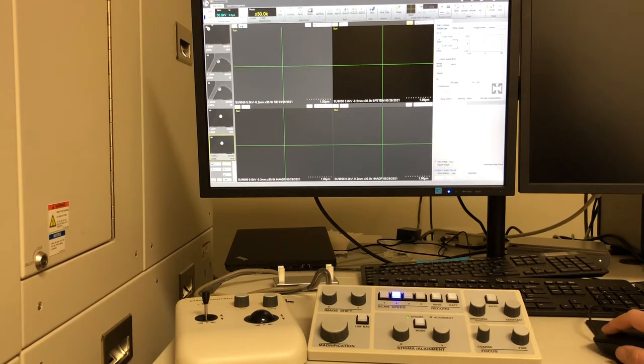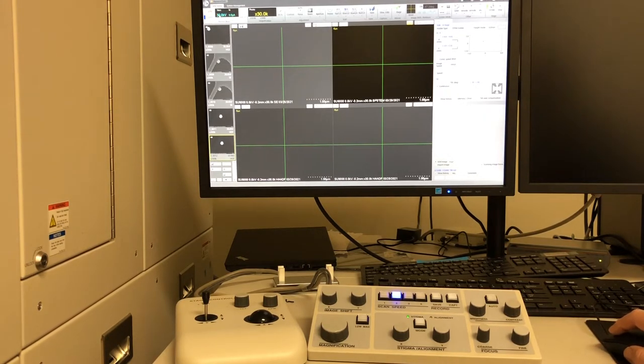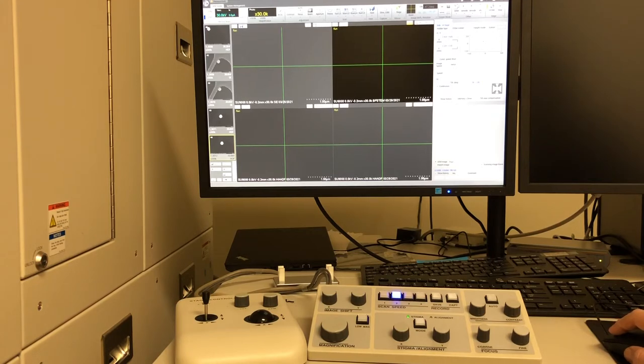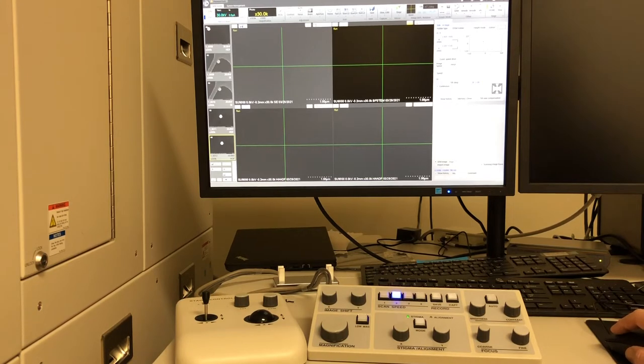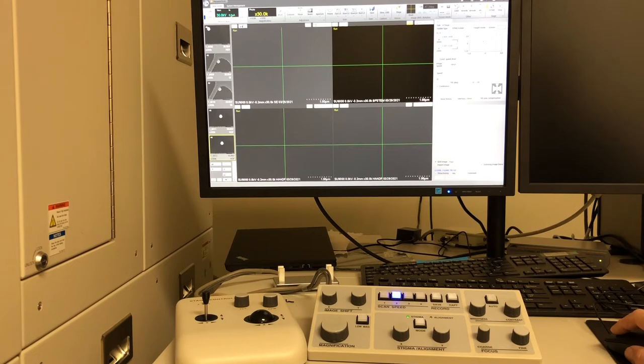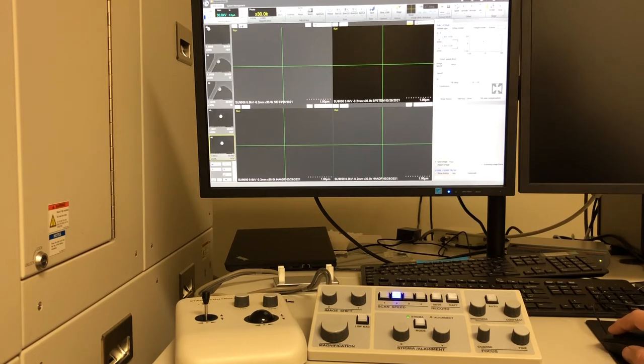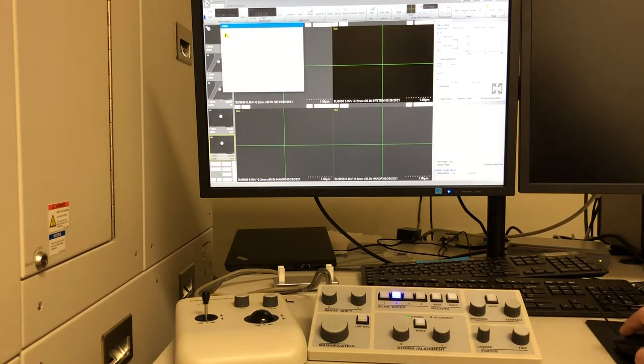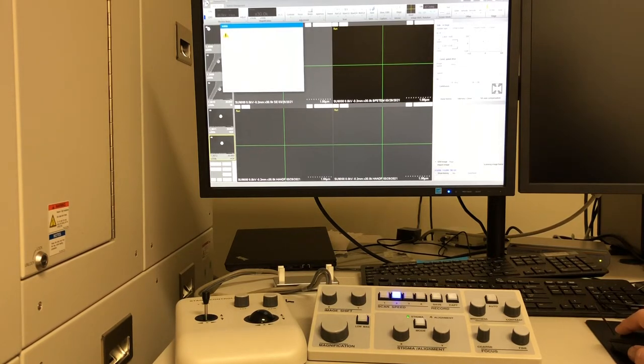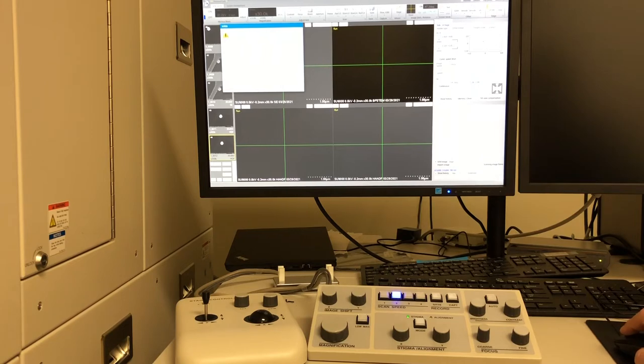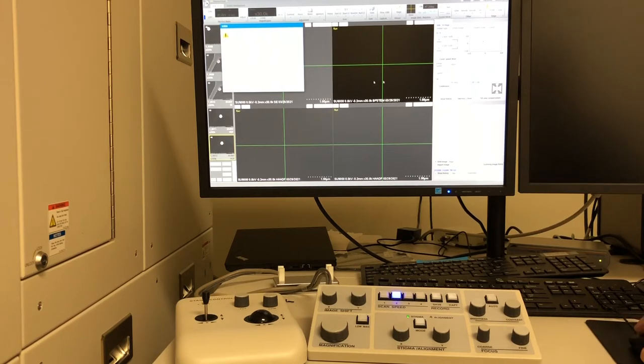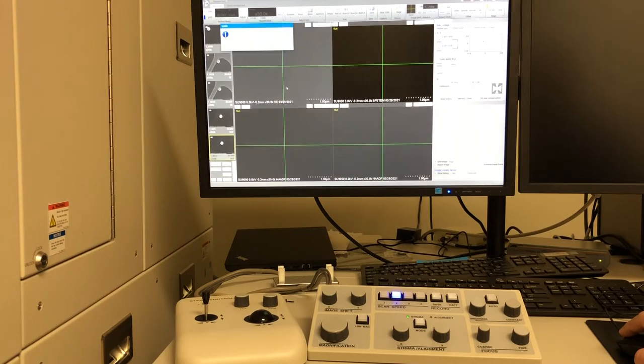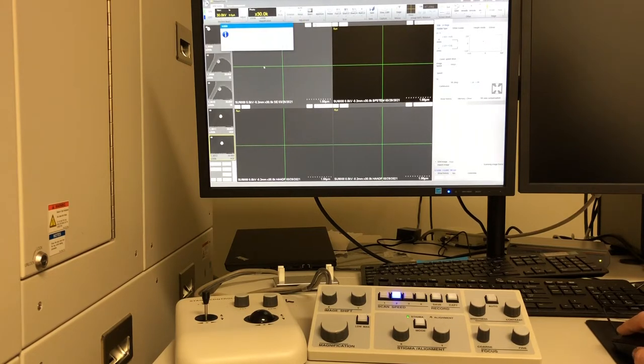Now you're able to turn the beam on. I'll be imaging at 30 kV with 10 microamps of current. So we'll press on. This window that pops up is related to the stem holder, which we've already checked through on the right panel. So we'll hit okay. And now we just wait for the beam to turn on.